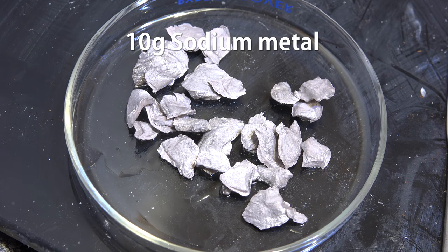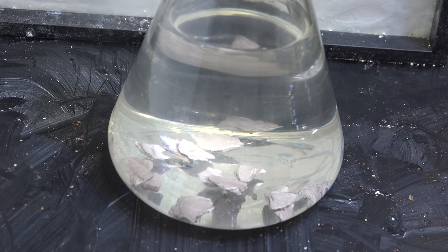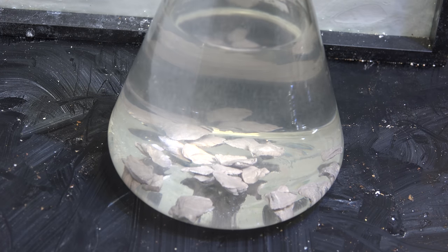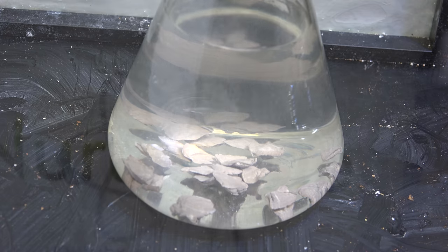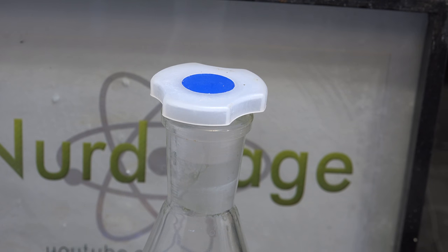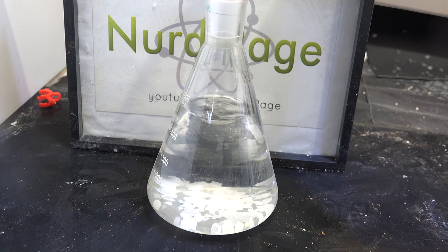Get about 10g of sodium metal and cut it up into small pieces, then add them directly to the ether. You can see it start to bubble as the sodium reacts with any remaining water impurities and generates hydrogen gas. I'm going to loosely stopper the flask with a plastic stopper so the hydrogen can still squeeze out and escape but keep most of the ether vapor in.